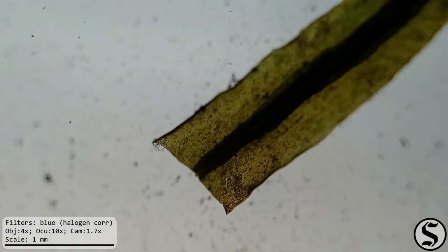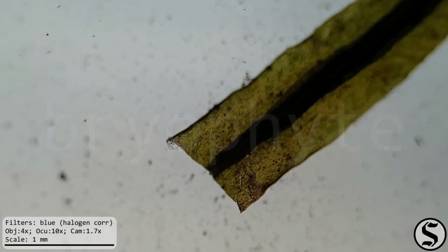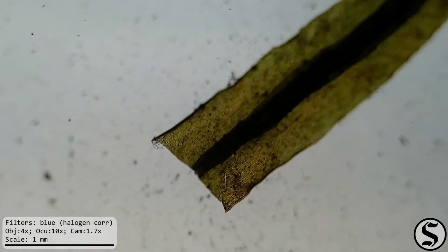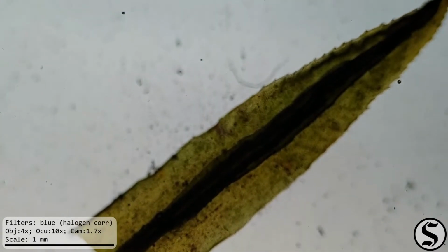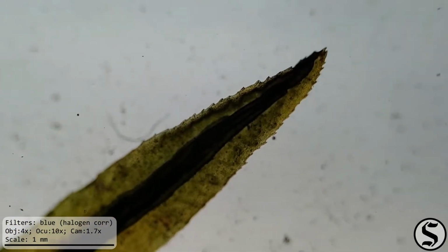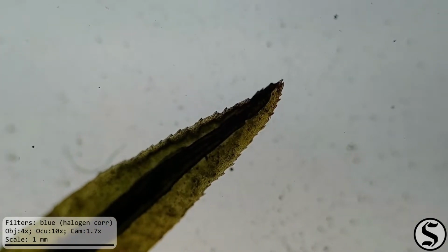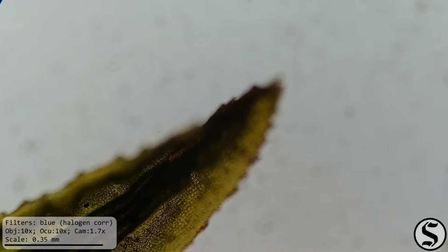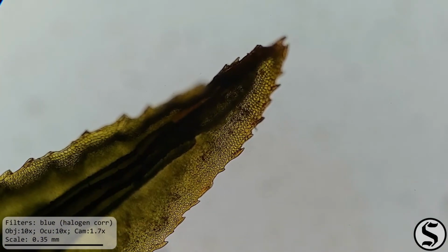Mosses are known by the scientific name bryophytes, which comes from the Greek bryon for moss and phyton for plant, so simply the moss plant. Unlike the carrot we were looking at last time, mosses are non-vascular plants, which means that the plant is much less efficient at transporting water to its various parts. It doesn't have a system of those tracheids like we saw in the carrot, and that's why mosses tend to be small and low to the ground.